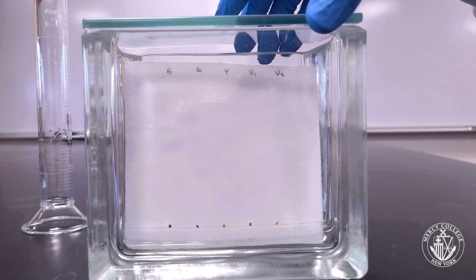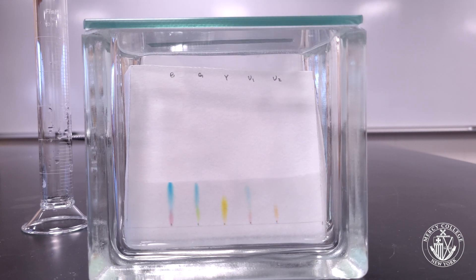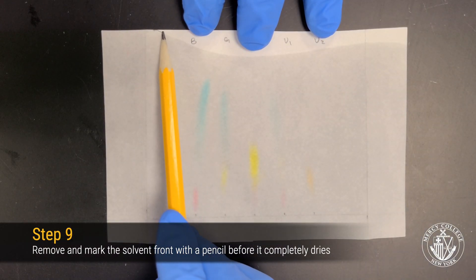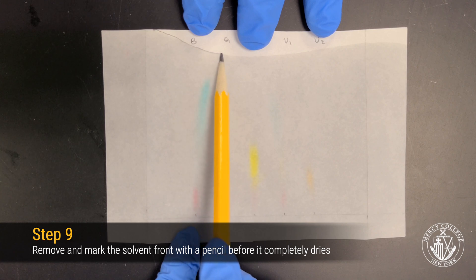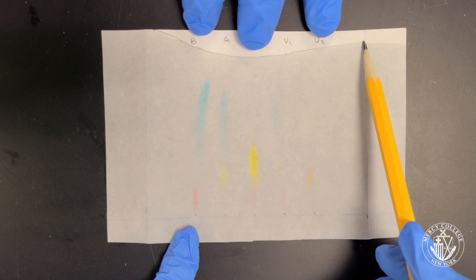Replace the lid on the developing chamber to reduce the amount of solvent that evaporates during the developing process. Wait until the solution rises to within two centimeters of the top of the chromatography paper. If the solvent reaches the top of your chromatography paper, it may be necessary to redo your chromatogram. Remove your chromatogram from the developing chamber and make sure to mark the solvent front before the solvent dries. Let the chromatogram fully dry on a paper towel.